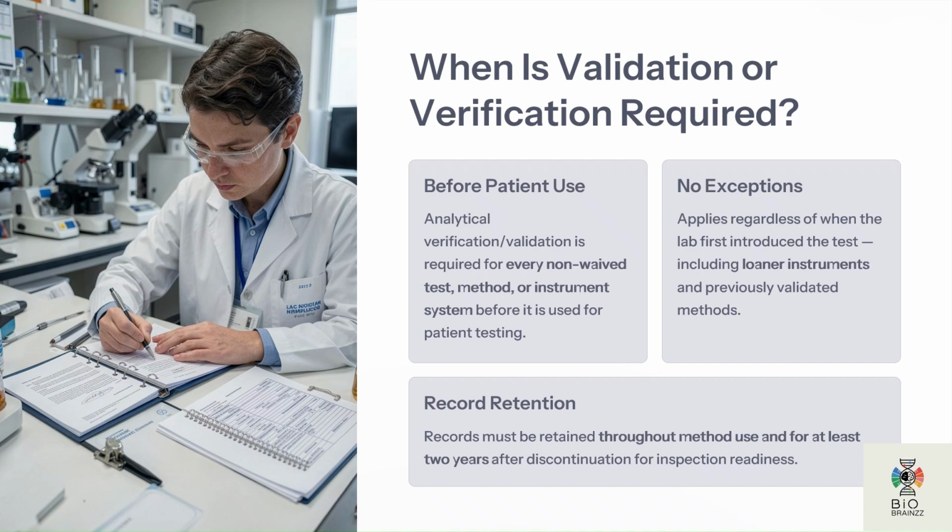Even if a method was previously validated elsewhere, verification must be performed before implementation in a new laboratory setting. Another important requirement is record retention. Validation and verification records must be maintained throughout the life of the method and retained for a specified period after discontinuation. Proper documentation ensures inspection readiness and regulatory compliance.